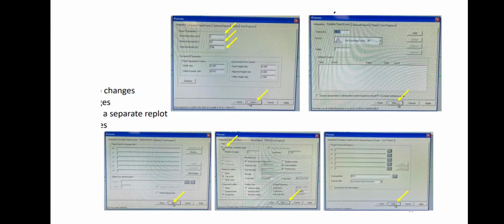For the autosampler, set the injection volume to 10 microliters for caffeine with no further changes. For the pump configuration, make no changes. In the pump program, set row 0 to an equilibration time of 1, flow rate of 1 milliliter per minute, and pump A at 100%. In row 1, set the runtime to 5, flow rate to 1 milliliter per minute, and pump A at 100%. For instrument timed events, make no changes and click Next.